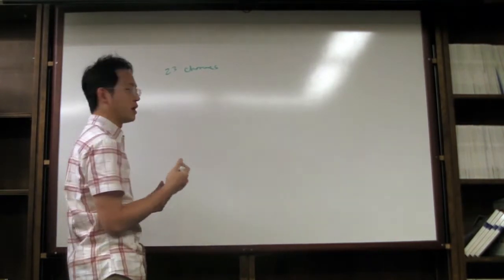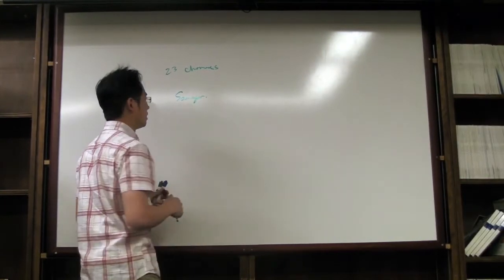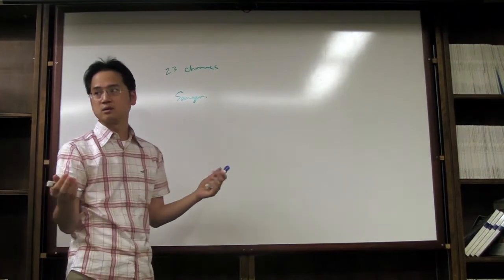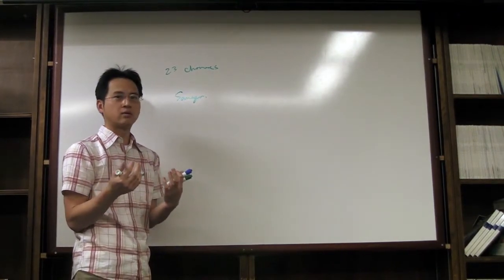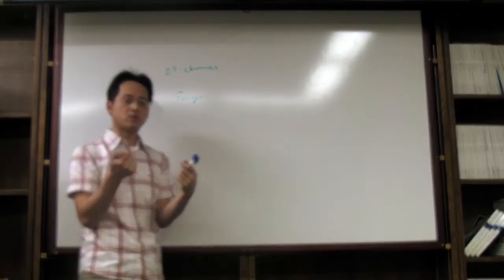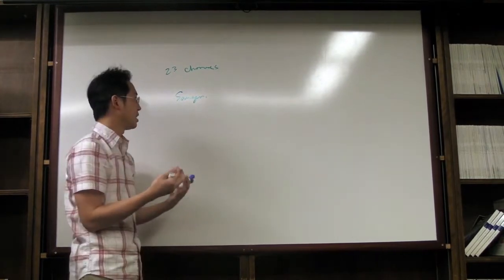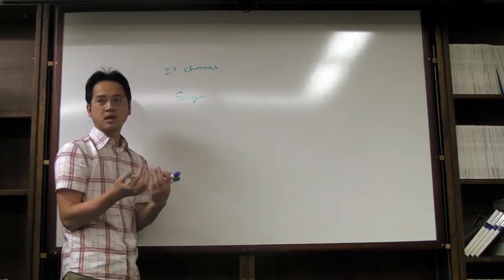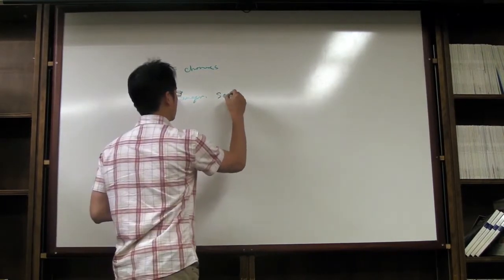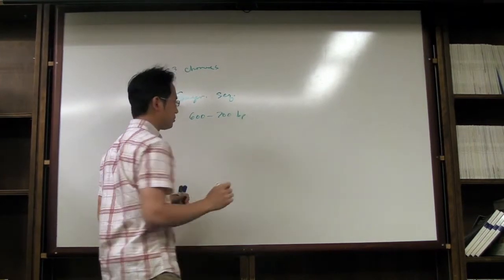So let's just throw down some limitations about Sanger sequencing, right? Just to quickly review. With PCR you can do as long as you want, right? 10,000 bases, 20,000 even if you have the right polymerase and the right conditions. But with Sanger, the limitation when you combine your dNTPs and your ddNTPs, you really can only get on a good day maybe out to 600, 700 bases at best. So that means you have to work within the context of Sanger sequencing, which gives you perhaps on a good day 600 to 700 base pairs.